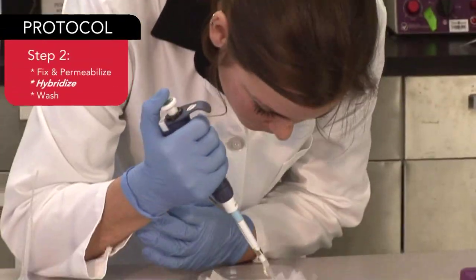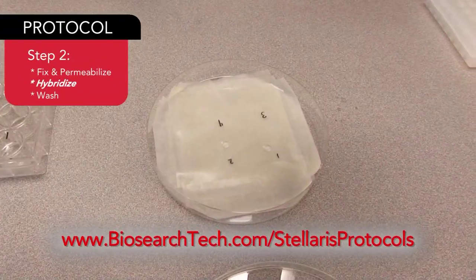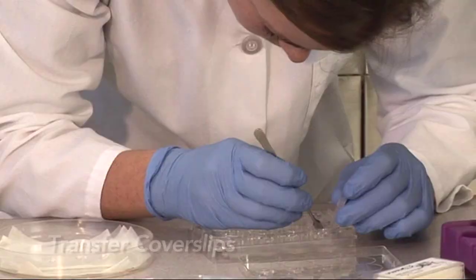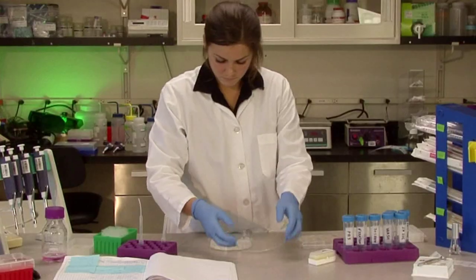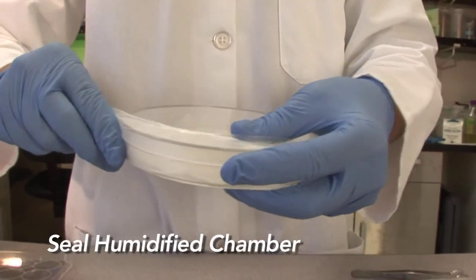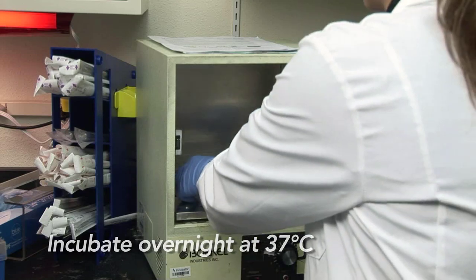Now for each cover slip, a 15 microliter drop of hybridization buffer plus Stellaris probe plus unlabeled primary antibody is added. The cover slip with cells is carefully transferred face down. The plate is capped and sealed with parafilm. This will keep the insides of the plate humidified. In this experiment, the cells will be incubated overnight at 37 degrees.